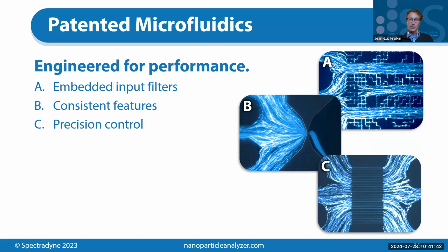There's a question here. If I need to check some protein markers and if they express on the surface and inside the EV membrane, can we differentiate both markers? Okay, that's a good question. So we have means of making internal nucleic acids fluorescent, but if you're using an immunostaining approach, the antibodies are not going to penetrate the EV. So any fluorescence that you get from immunostaining is probably going to be externally labeled, or externally bound proteins.